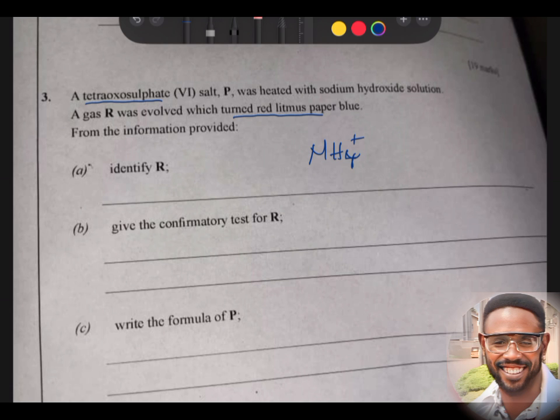That is the salt. It's not actually a test for sulfate. Rather, what they stated here is a test for ammonium salt. But it's only a clever student that will understand what they mean there. So WAEC, touche, congrats. I love this question. Very nice. Okay, then students, sorry if the question pulled you.